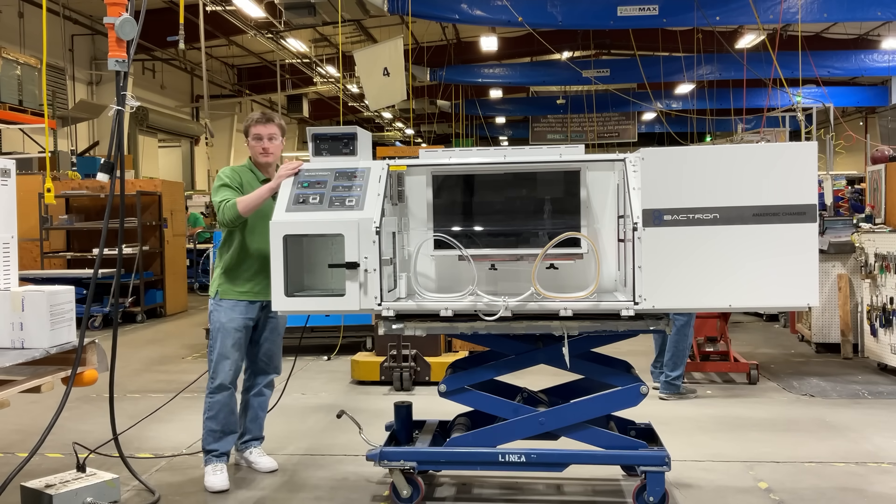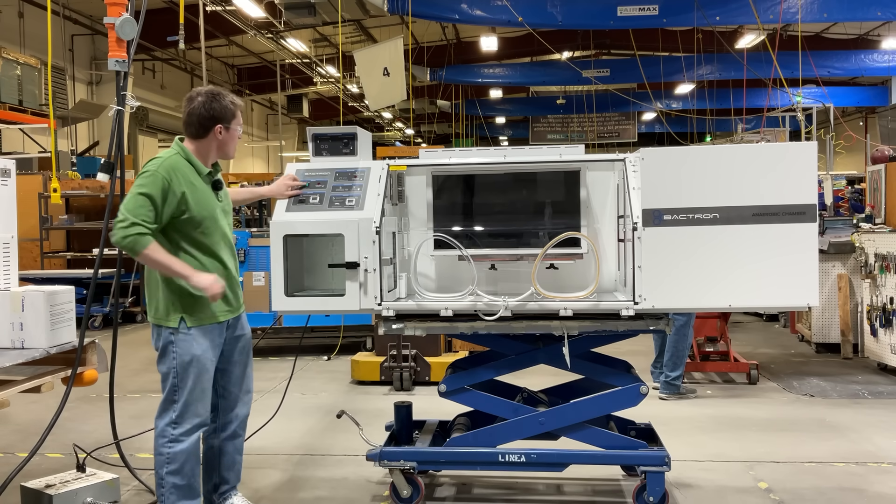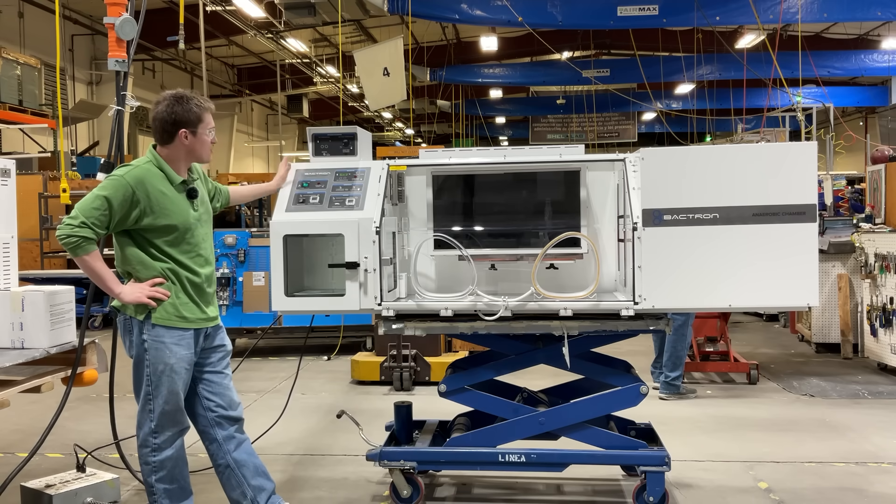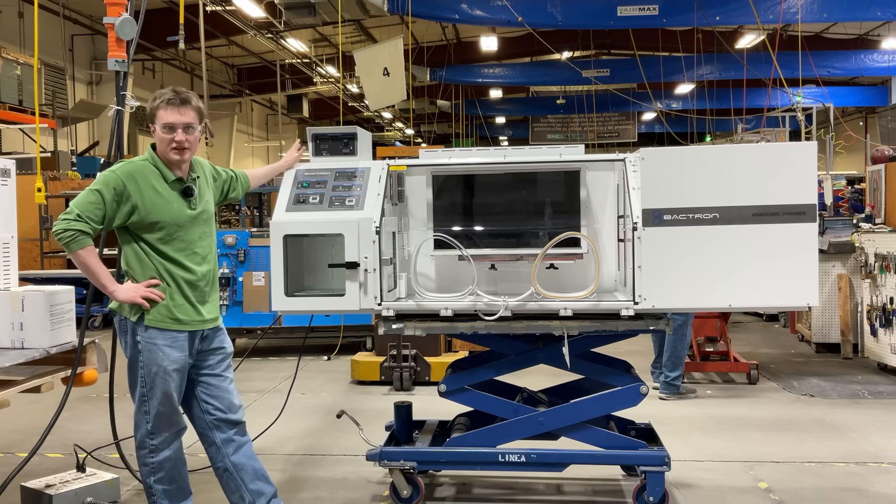Now let's get the unit plugged in and powered on. The main power switch is located here. After turning it on, the control panel features become available.